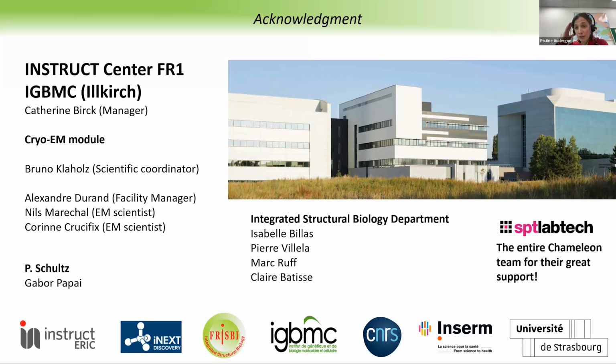Thanks. And I will ask a very quick question. So in your pipeline at the moment, do you always use the Vitrobot first, and if you have issues with the samples, you go towards Chameleon, or in some cases, you know that the sample would fit better with the Chameleon technique for sample preparation?